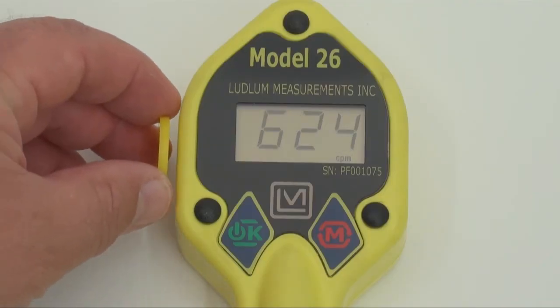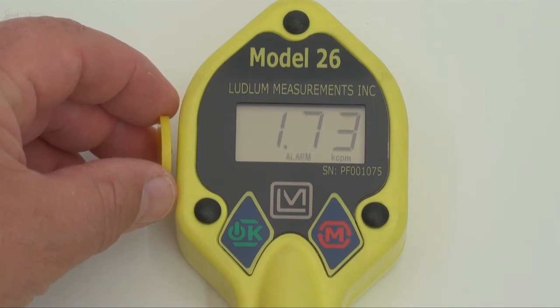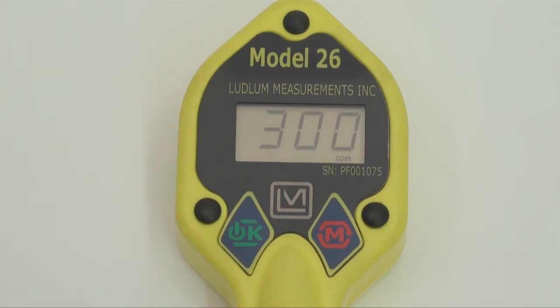The LCD displays the counts in either counts per minute or counts per second, and can be programmed to alarm if the counts exceed the desired setpoint.